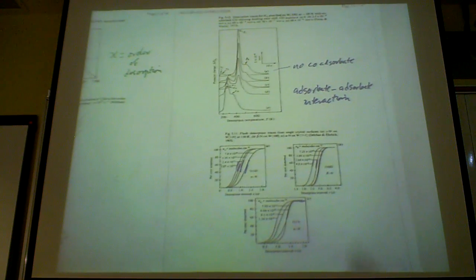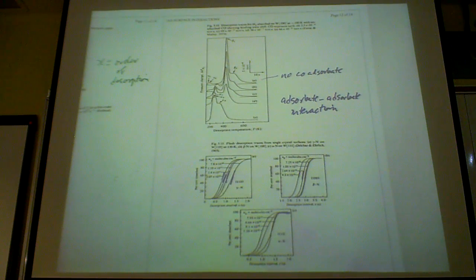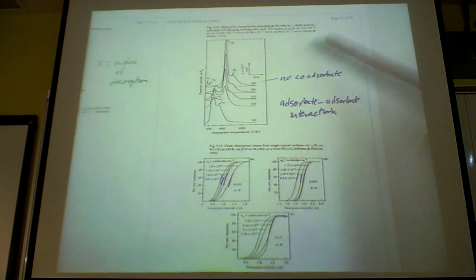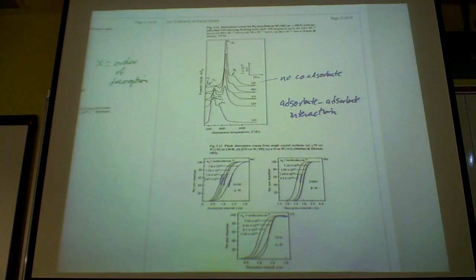And here's a little bit more example that I show as you change the desorption rate, the flux, what happened to it. One of the interesting things that you can see is that all these peaks that you see, you call them desorption states. And it's a rich chemistry that you can get out from thermal desorption, because you are heating your surface and you are promoting surface reaction as this occurs. And if you have a mass spec, you can look at what the gas composition of that desorbed gas from your surface looks like.